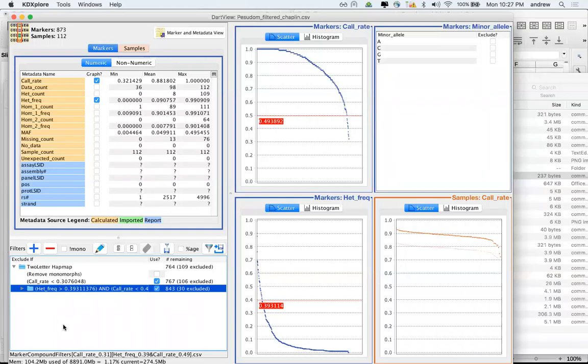And so at any point, I can save and create as many data sets, as many subsets rather, as I'd like. And these can be re-uploaded back into the GOBii system. And I believe we'll also have a feature to be able to store these filtering rules alongside, so that you can easily retrieve them in future.